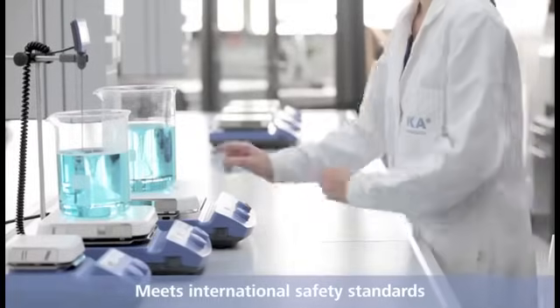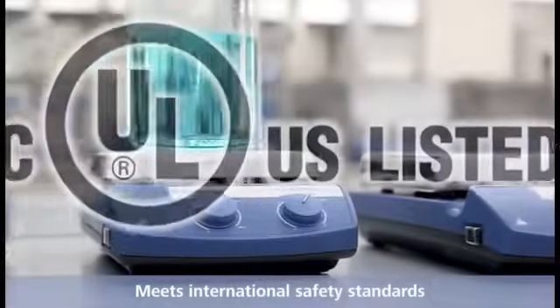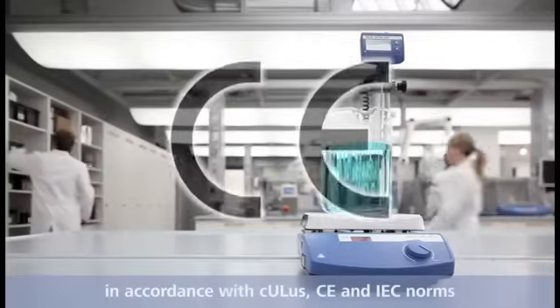The devices of the IKA C-MAX series meet international safety standards. They are in compliance with UL, CE and IEC norms.